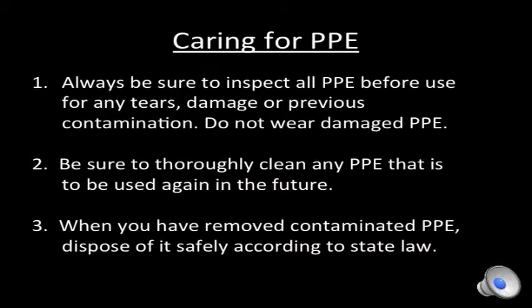It is very important that you not only use your PPE effectively, but that you care for your PPE correctly. When using PPE, always be sure to inspect it for any damage or previous contamination before use. Do not use damaged PPE. Find a replacement. If you are reusing PPE, such as reusable gloves, make sure they are clean before storing them.